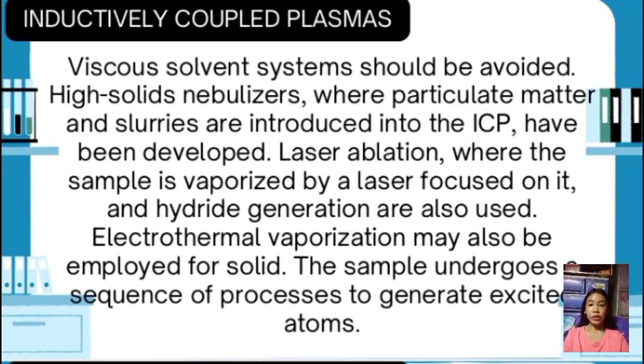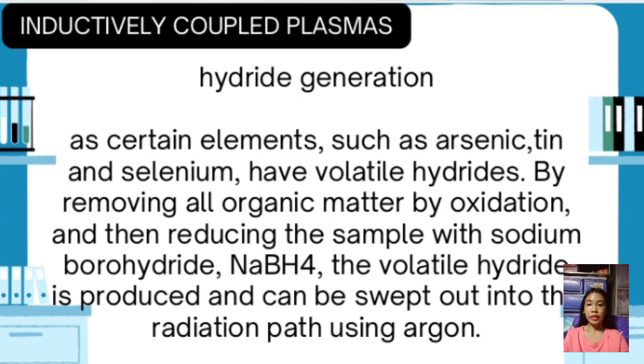Other innovative methods such as laser ablation can also be employed, where a focused laser vaporizes the sample directly. This technique allows for direct analysis of solid samples and is particularly useful for materials that cannot be easily dissolved or aerosolized.